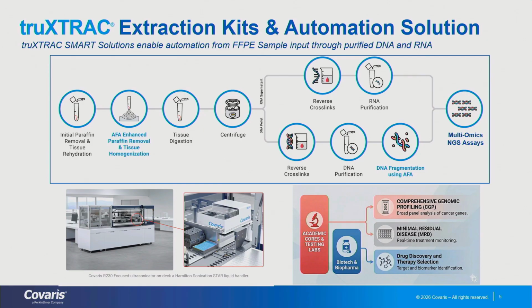And by that, we can make the proteinase K treatment downstream more efficient. We spin down the sample, which makes the DNA end up in the pellet and the RNA in the supernatant. And by purification of both these fractions, then we have DNA and RNA from the same sample, which can be used for further downstream processing. And the quality is very good, both for DNA and RNA, and particularly the RNA sticks out as very high quality with a high molecular weight RNA.